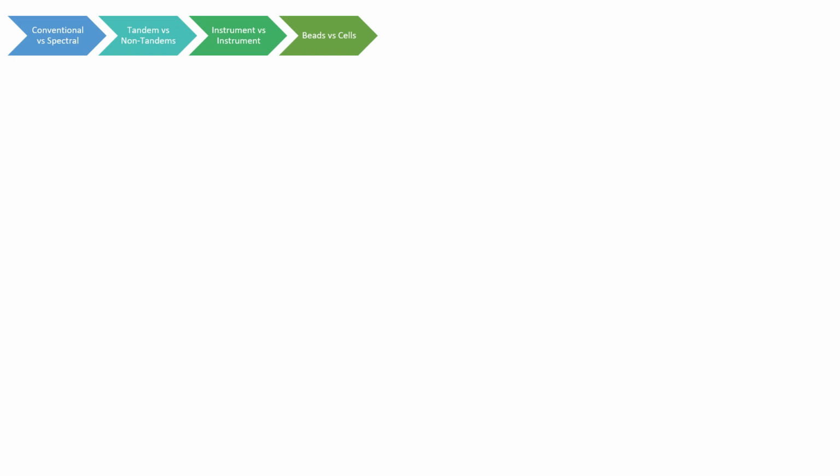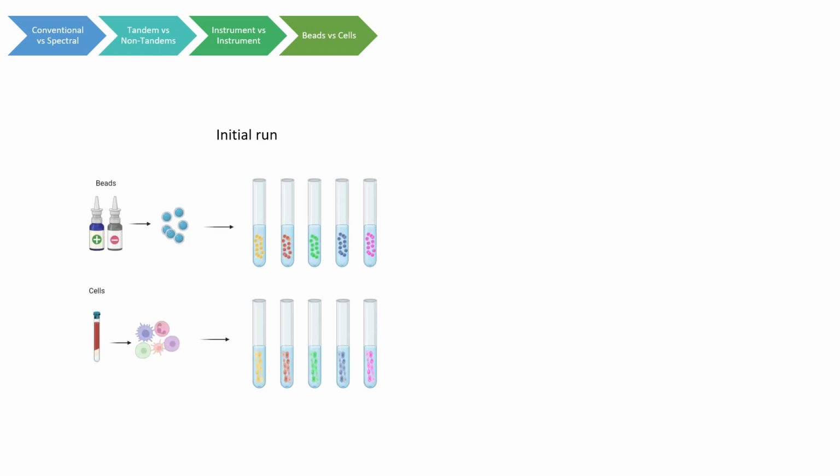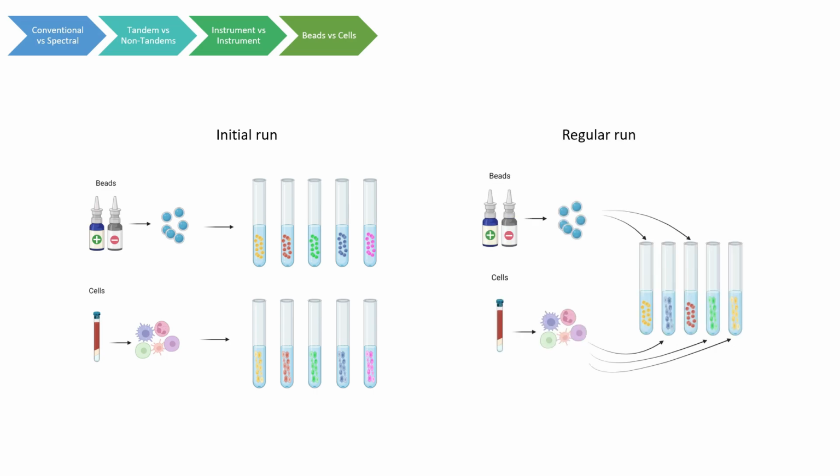We recommend for your first experiment that you bring both beads and cells. Then verify which best unmixes your sample. It might be that you will end up using a mixture of beads and cells for the best unmixing.